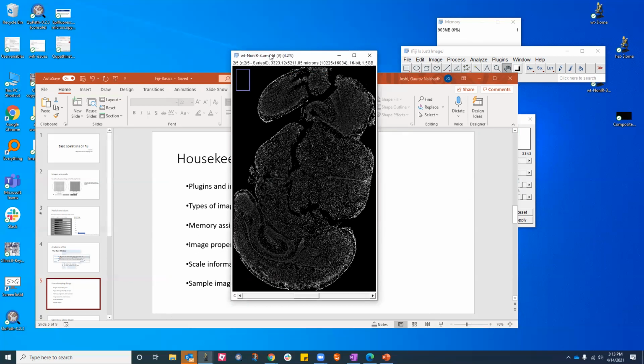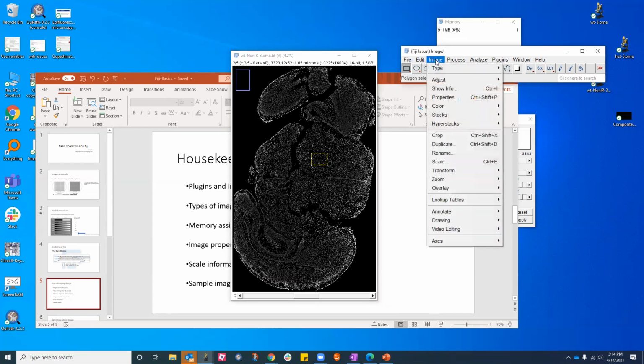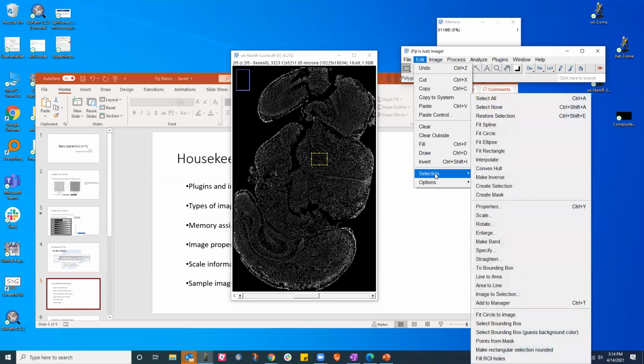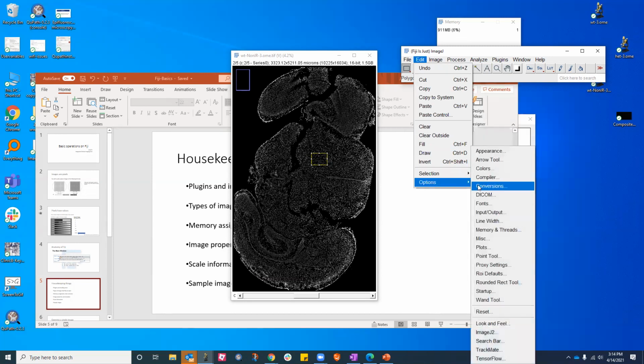Actually, one more thing, the color selection, which I forgot. Let's say when I'm selecting something, it's giving me this yellow colored box, right? Now, if you want to change this box, you can change the color of that. You can make it look anything that you want to.